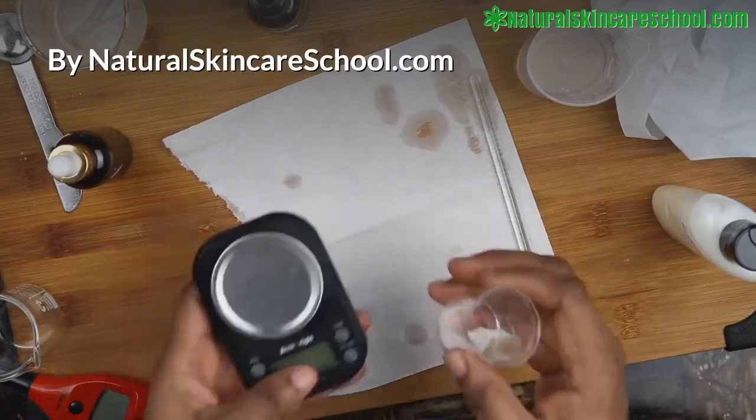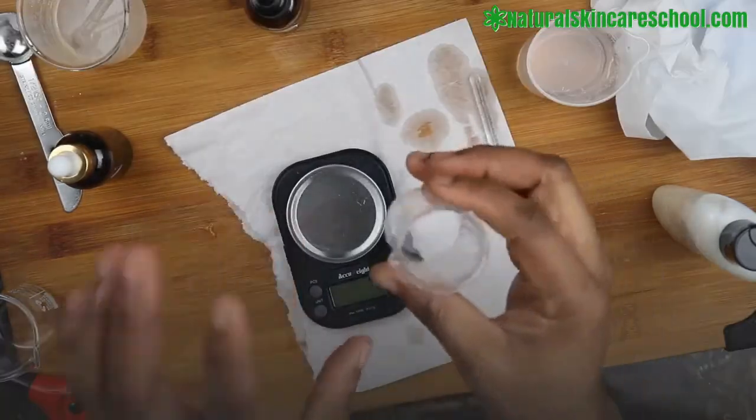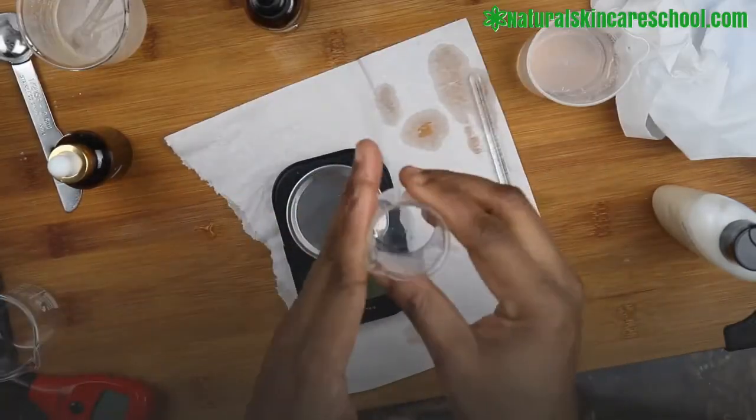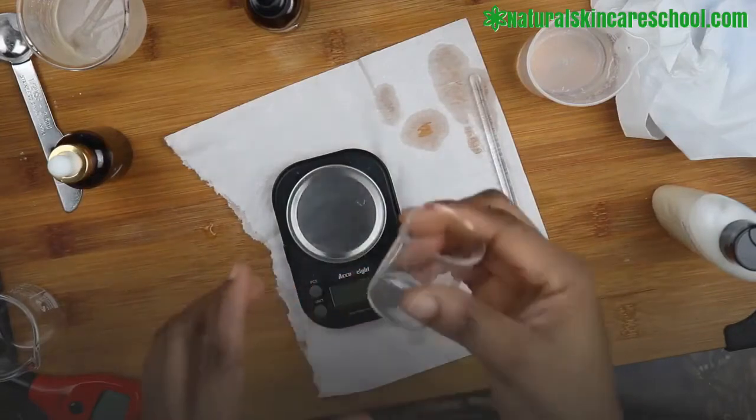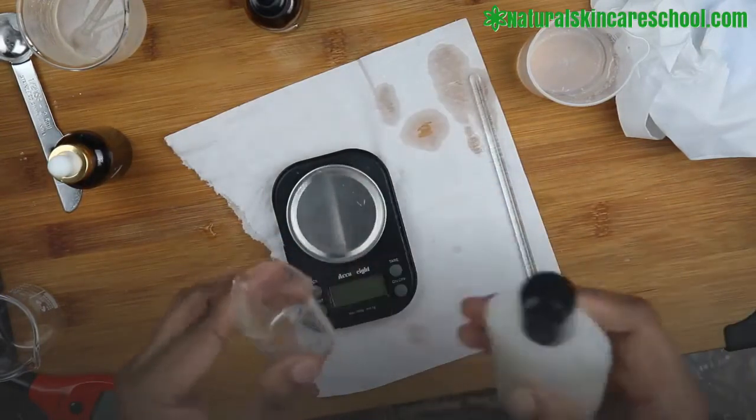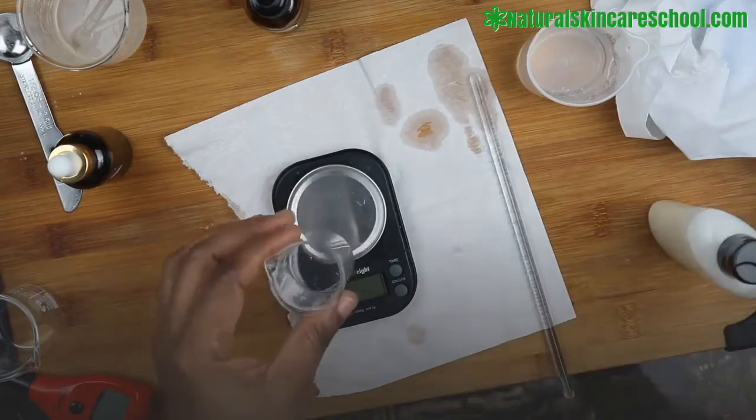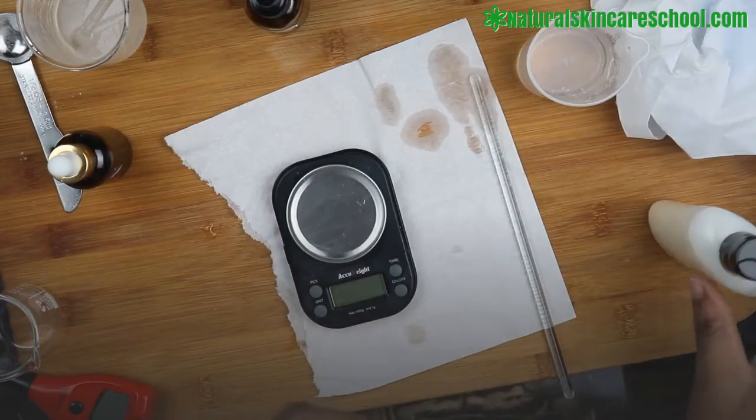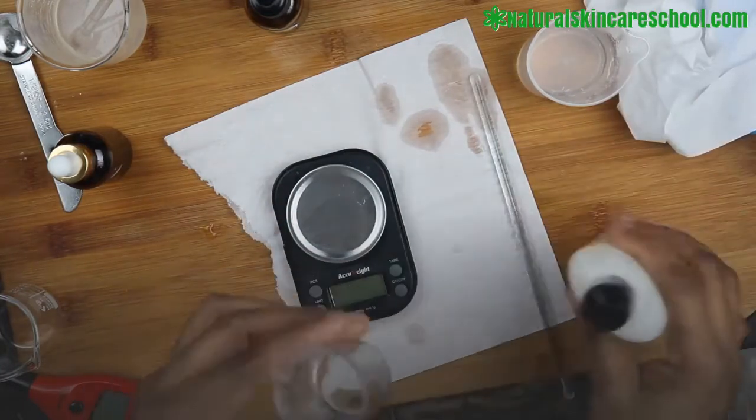To check the pH of your lotion, you need a scale, you need a beaker or anything you can put your mixture in. What we're going to do is take 1% of whatever lotion you have, then we're going to add 9% water to it. So we're taking one gram of the lotion and we add nine grams of water to it.